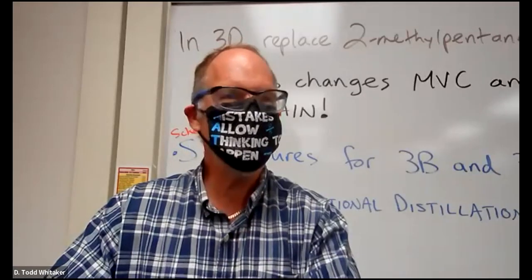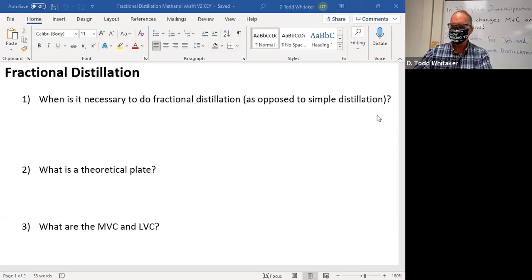All right, ladies and gentlemen, we are going to discuss fractional distillation. And here we go. Here's a worksheet for us. You get to keep this worksheet. It's not an assignment. You should have a copy in green.